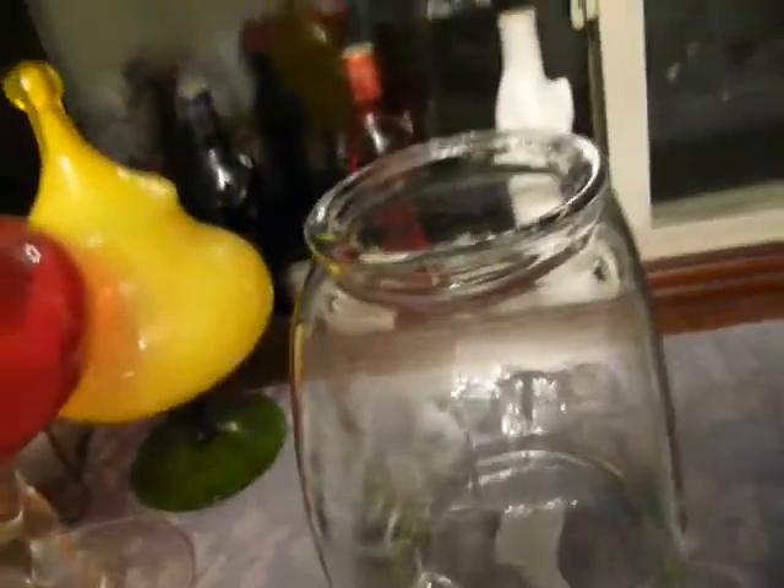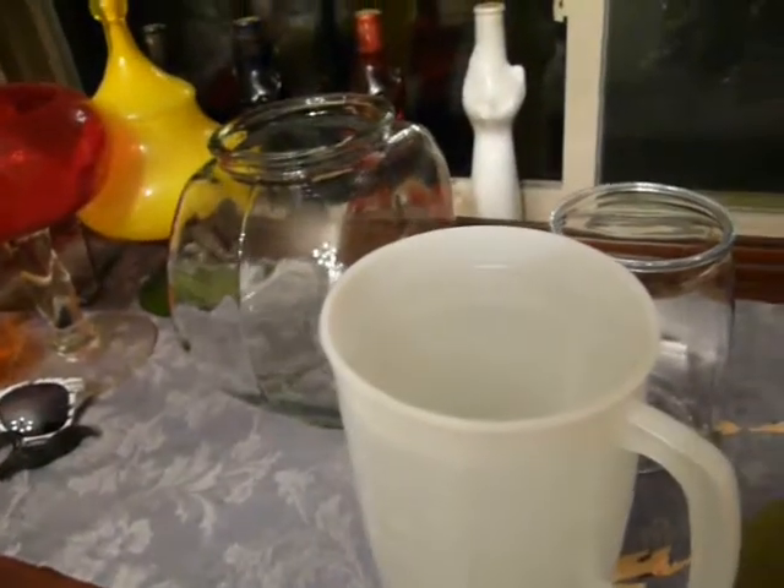My question is whether the marimo moss ball plant affects water quality, which includes pH, hardness, alkalinity, nitrate, and nitrite. I think I'm missing something — I'll put that in later. For each, I'm going to have two moss balls, and then I'm going to have one which is plain water as the control. This is going to be the same amount of water in each — two quarts.